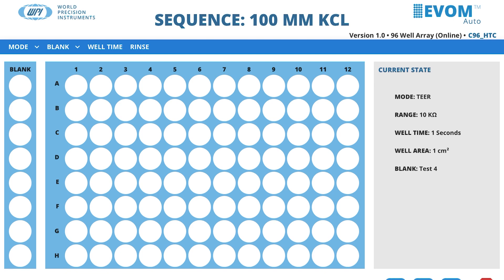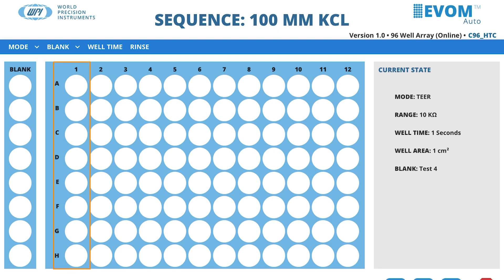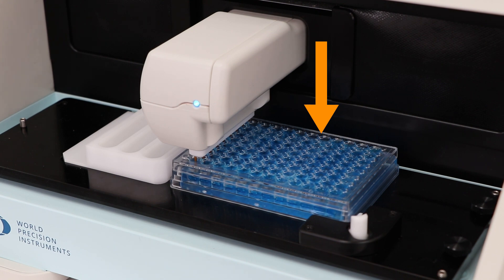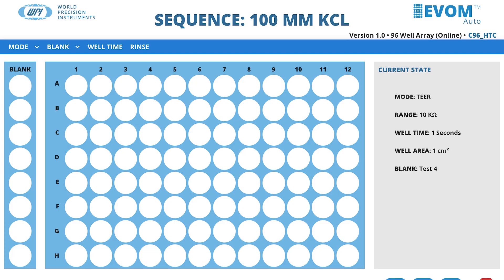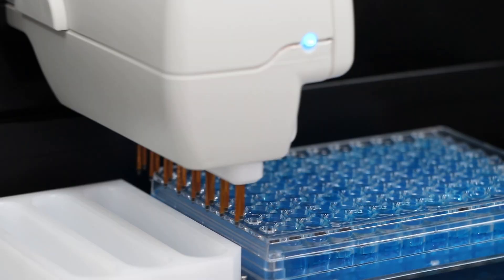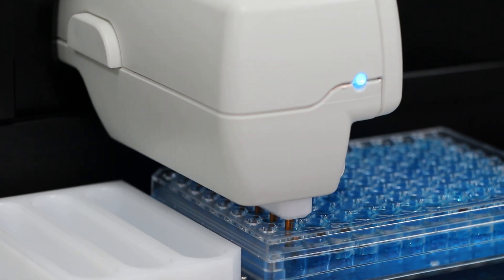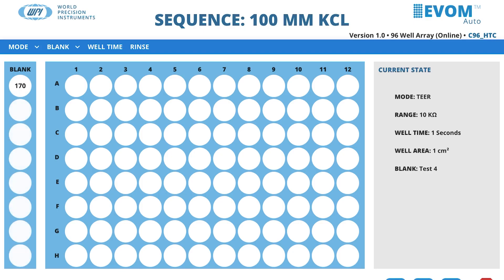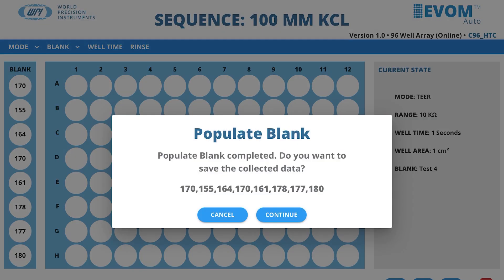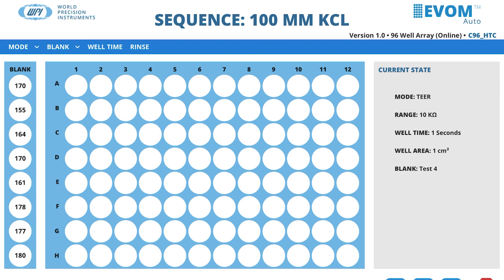The blank name is updated on the current state area. Load a well plate with media or buffer in the first column of wells and place it in the HTS well plate area on the Auto Sampler. To measure the blanks and load that information into the blank container, select the Blank menu and choose Populate Blank. The Auto Sampler moves the electrode array to column 1 and measures all eight values. The values are shown in the blank area on the window as they are populated. After the measurement is complete, you may resample the blanks as many times as desired, now or in the future, by loading this container and running the Populate Blank option again.